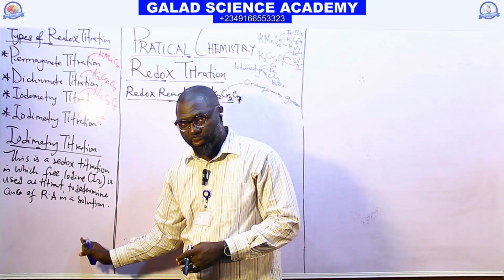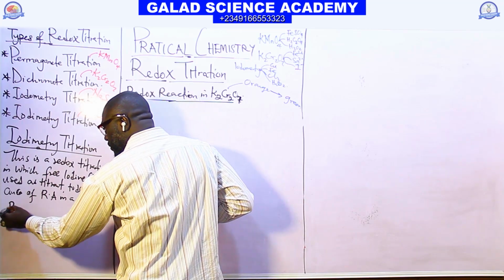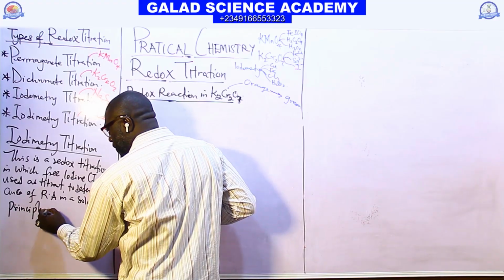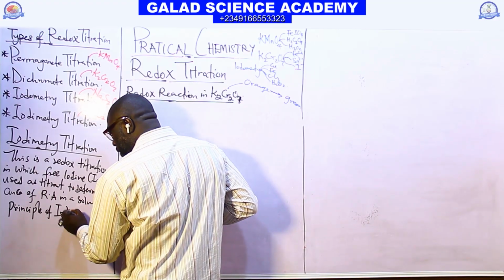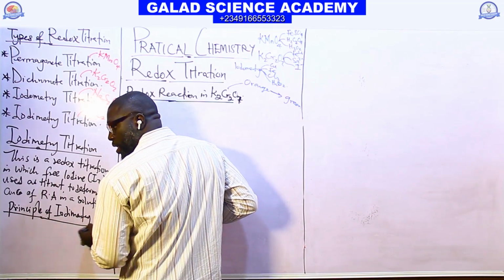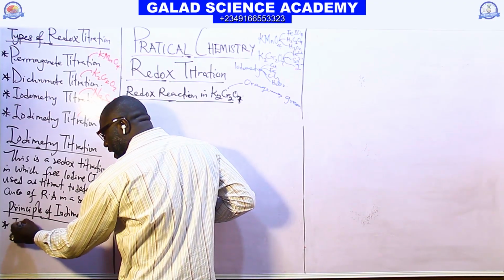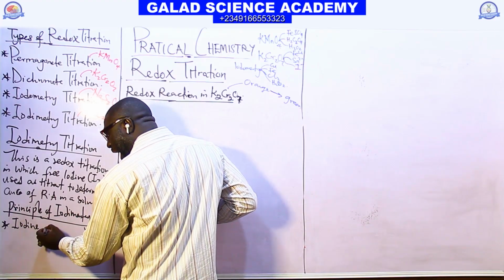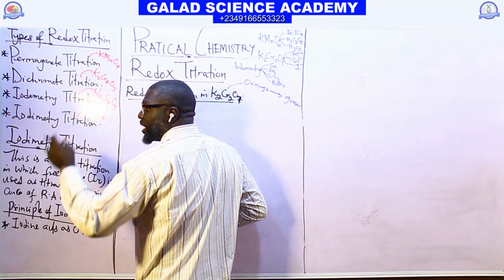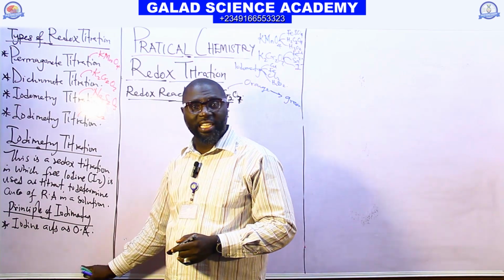In iodimetry titration, what is the principle? Here, iodine acts as oxidizing agent.